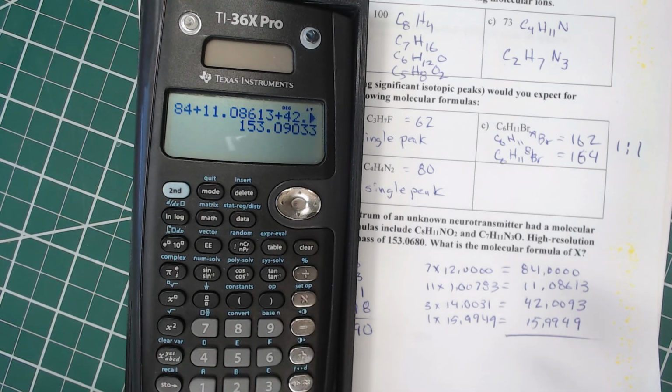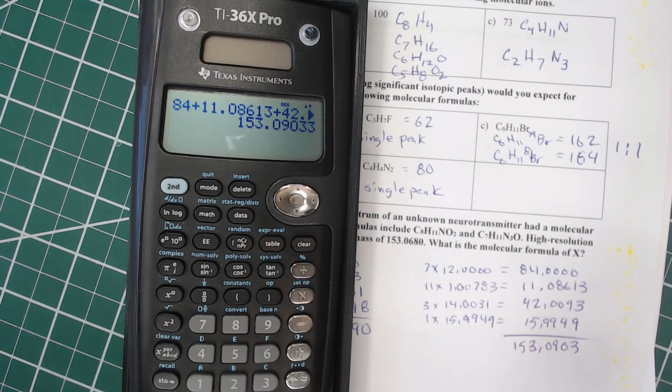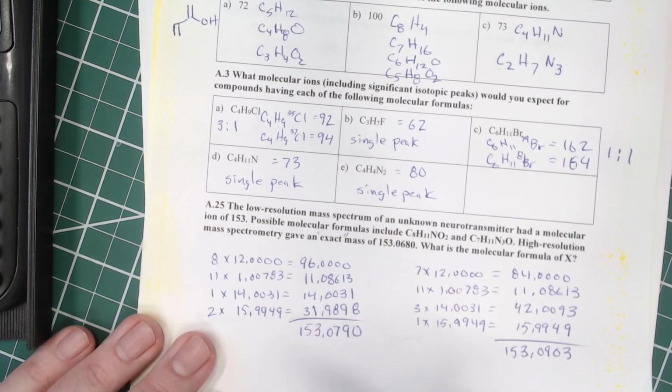And that gives us 153.0903. And if we compare this one and this one to that, this one is closer.